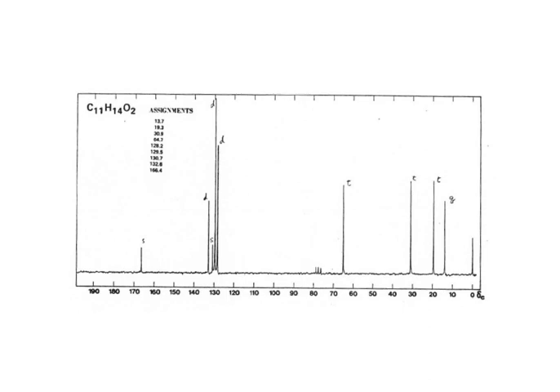Okay, so C11H14O2. Yep, we'd have a benzene, right? So we can see that at least in this region right here, we see this grouping of peaks. And remember, in this one, I've added in these annotations, S and D and T. And these are what type of multiplet that peak would be if it was a coupled spectrum.